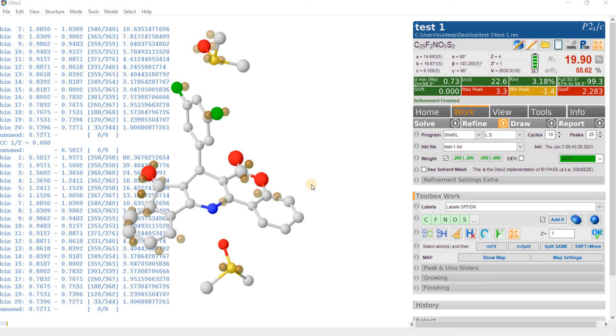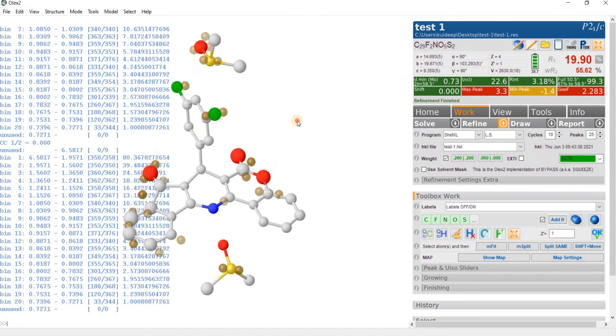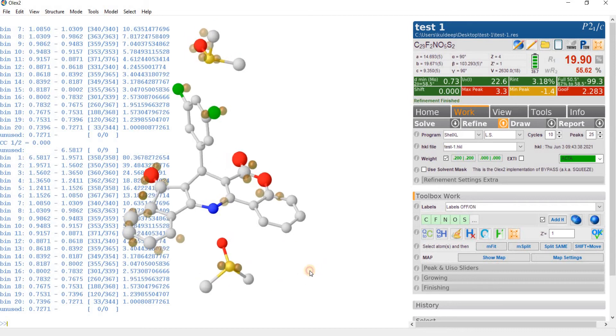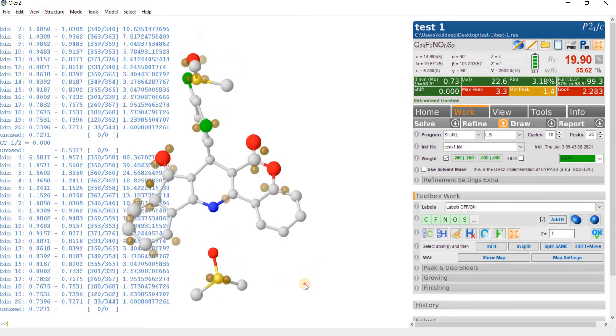Hello everyone, this is the isotropic model of a small organic molecule specializes in monoclinic space group P21/C with two DMSO molecules in the lattice.